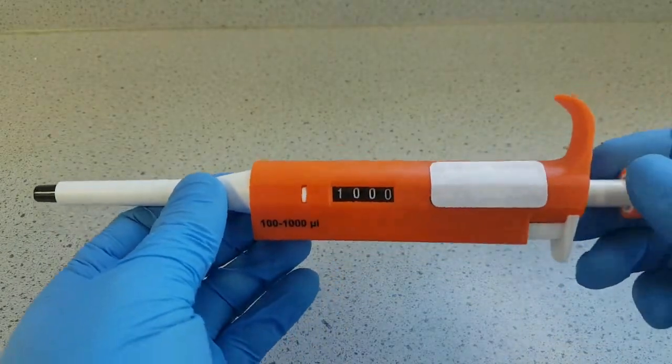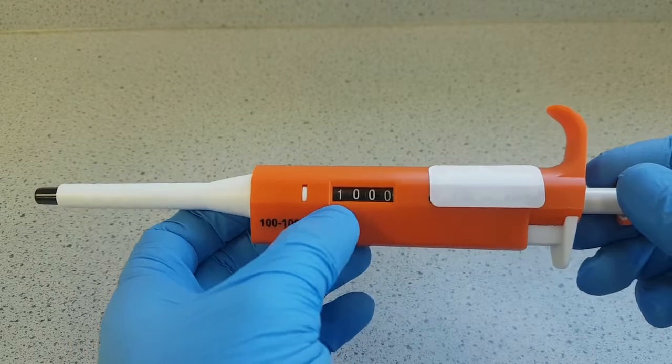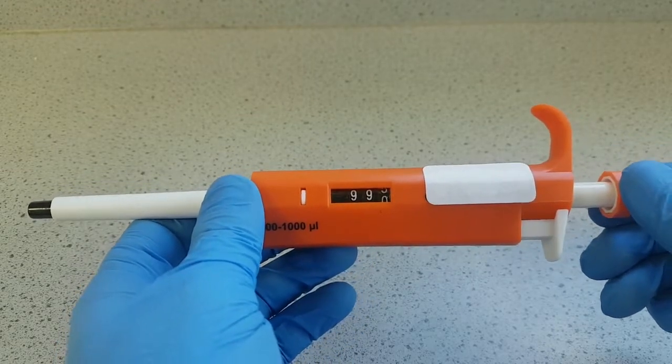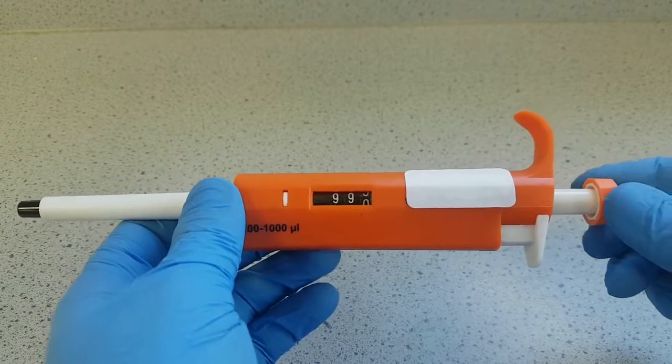On the side of the pipette you'll see a display window, which is currently set to 1000 microlitres, but you can adjust the volume by rotating the control knob here.